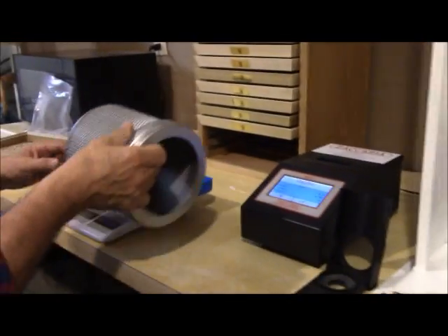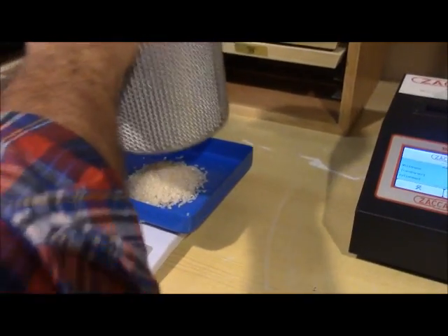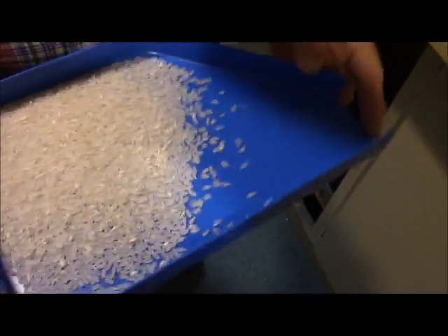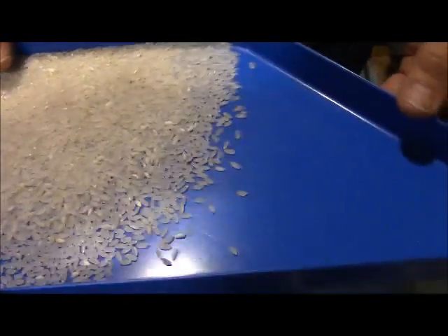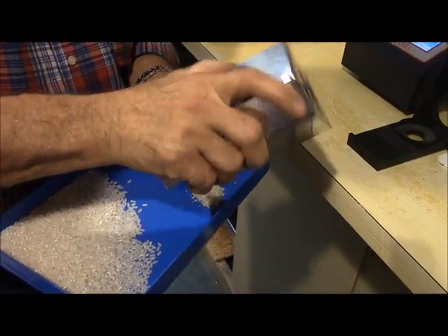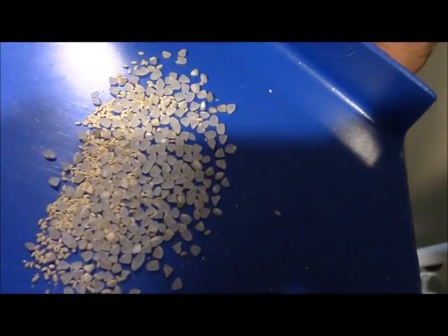Now we're ready to measure the sample to determine our head rice yield. Our head rice yield is 69. You can look at this material and see it has some chalk — that's inherent in the variety and the harvest. We're going to examine it closely with the brokens that were removed, and you can see the short waste material that was taken from the whole rice.